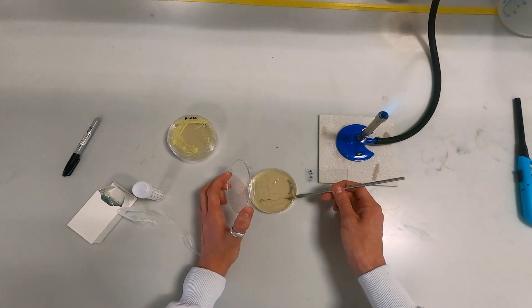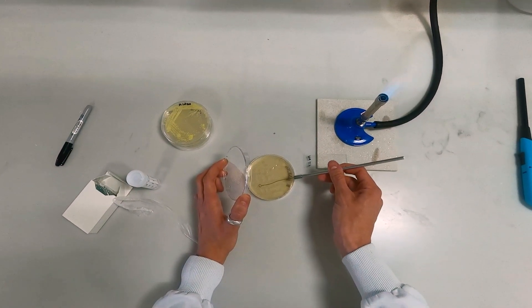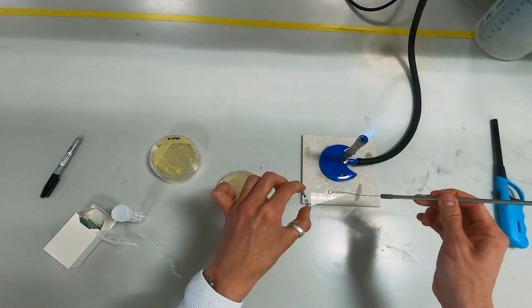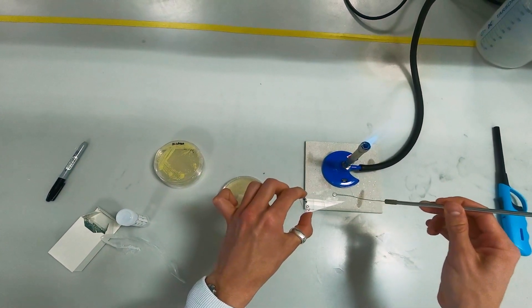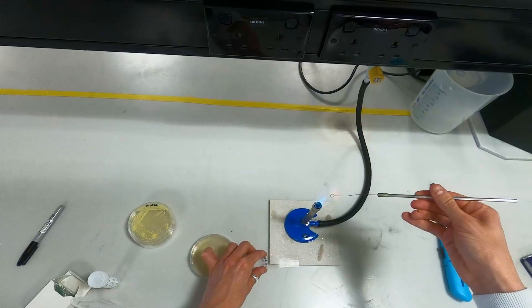Then when you're ready, scrape up a small colony and place it onto your slide. Spread that sample as far and as thin as you can onto the slide and flame your loop before you put it down.